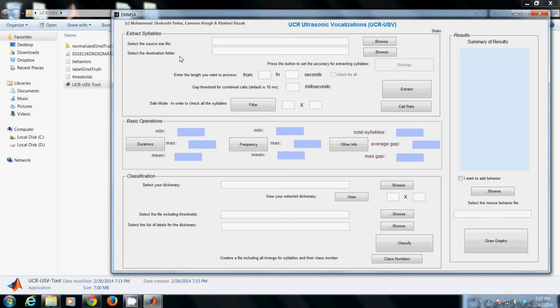Our tool is based on these recordings that we got from the neuroscience department, so it's just working for these files right now. For a different species, or for a different quality of recording, we may have to tune some of our parameters. That's easy. If you just send me a sample of your recordings, I can easily tune up the tool.